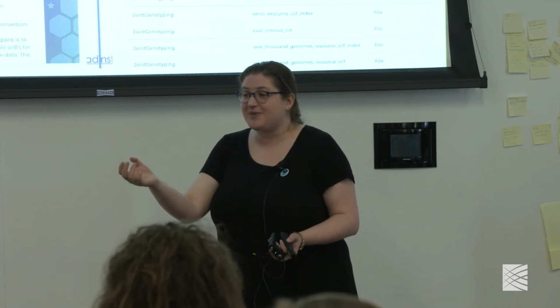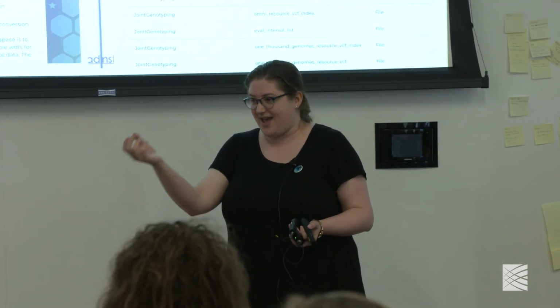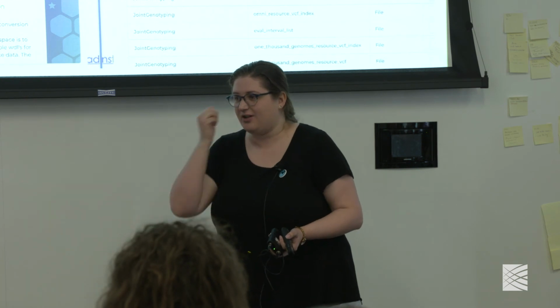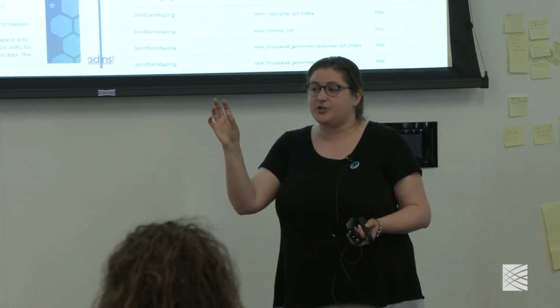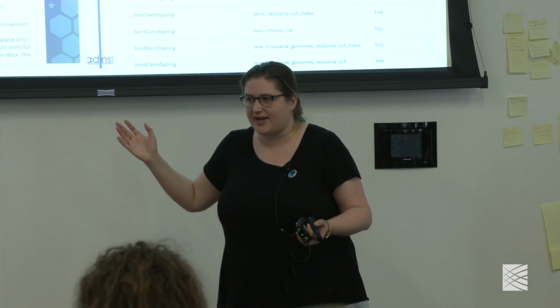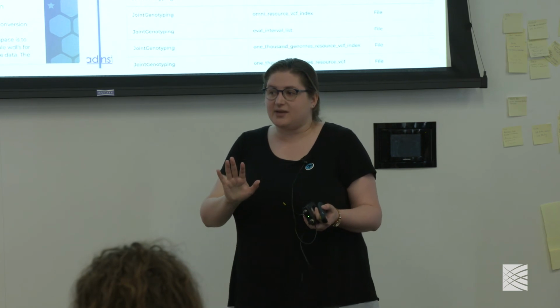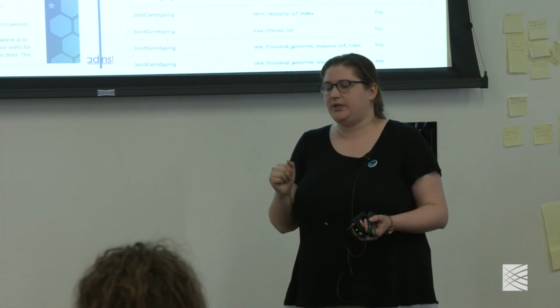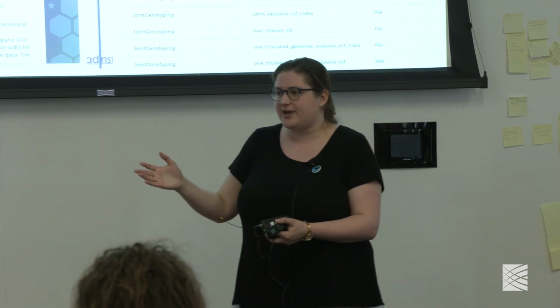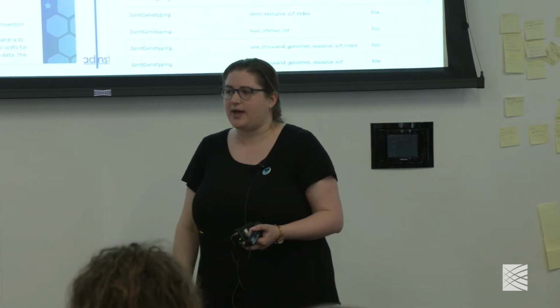If it's truly a germline event, then I would use haplotype caller and be very confident that that is a true germline call. You would still want to use that matched normal when running your somatic pipeline in order to filter out as many artifacts as possible, just from the get-go. So I would still recommend using it with your somatic pipeline if it's possible. But then if you wanted to do a further analysis after the fact and look at the germline calls, you could absolutely use haplotype caller to do that.